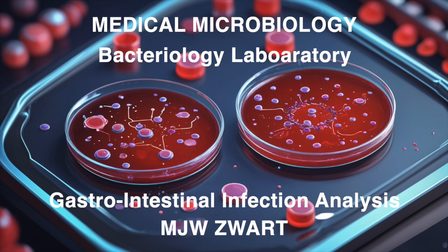Okay, so let's say we've picked our targets and we've got the cultures going. Now what? Those bacteria, they can be a bit picky. They really are. But luckily, Gemini helps us figure out the right media and the right conditions for each one. It's like a recipe book for growing bacteria. Agar plates, temperature, the whole nine yards. Okay, so we've plated the cultures. They've been incubating. What's next?